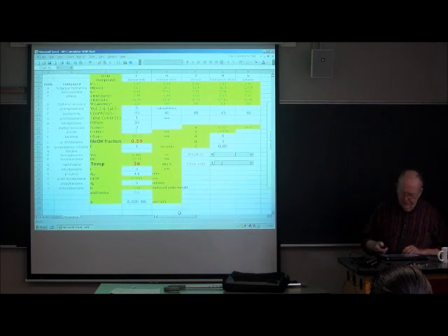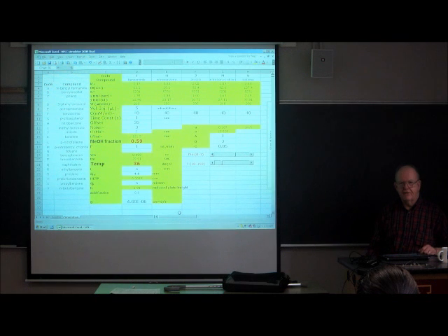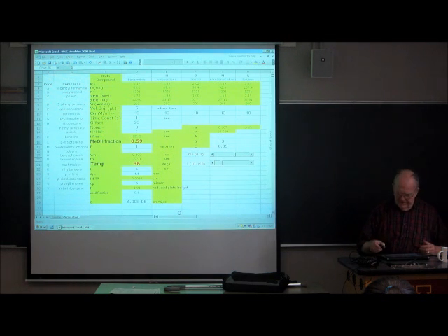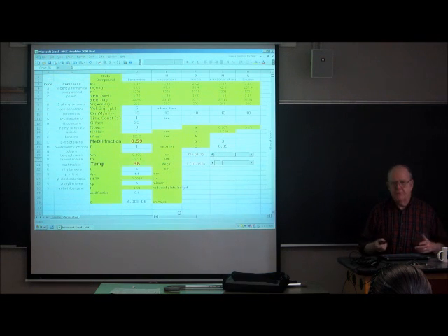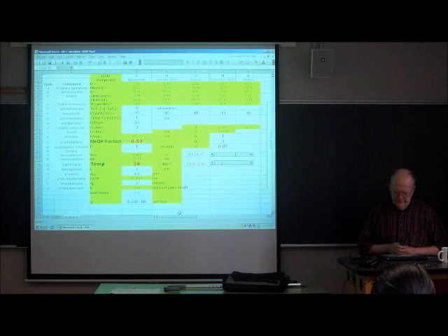One other minor point. I chose this diffusion coefficient. This is the diffusion coefficient of an average size pharmaceutical molecule. Something with a molecular weight of about, say, 300 to 400 would have this kind of diffusion coefficient at room temperature, in an aqueous organic mobile phase. And if you wanted to do a protein or something like that, you'd have to make that number a good bit smaller. But if you change that number, things are going to change.